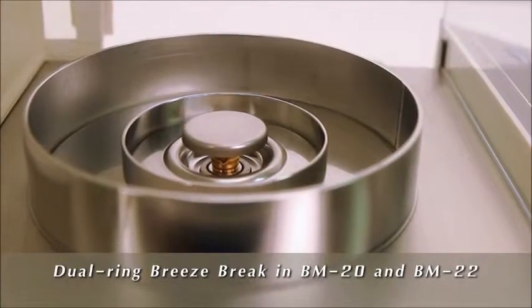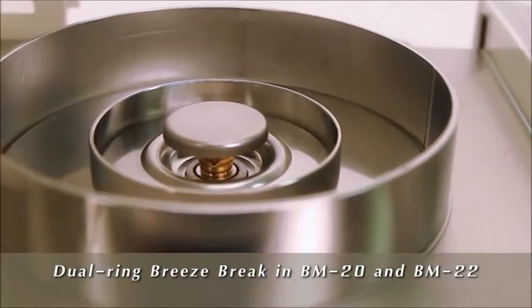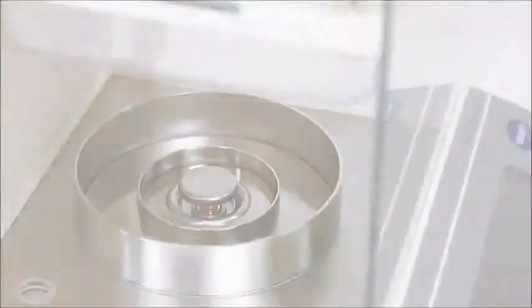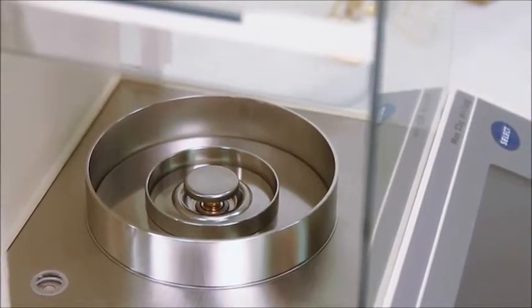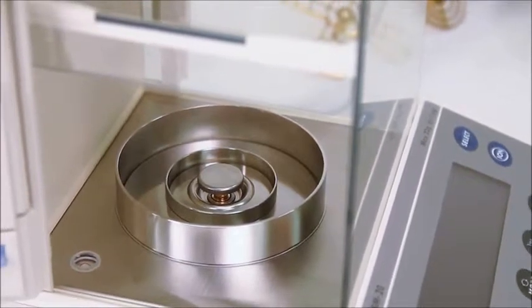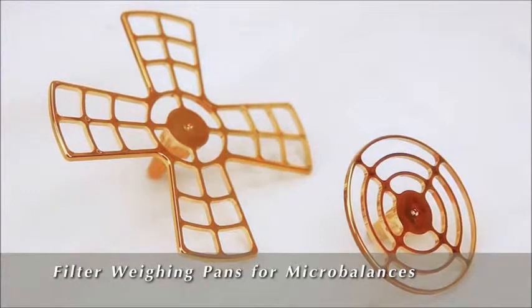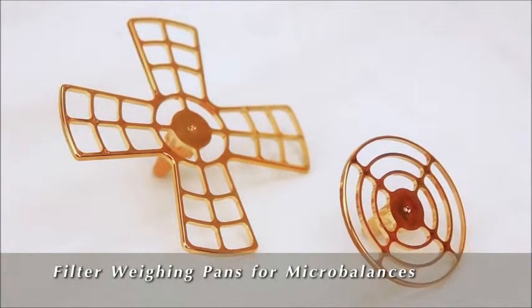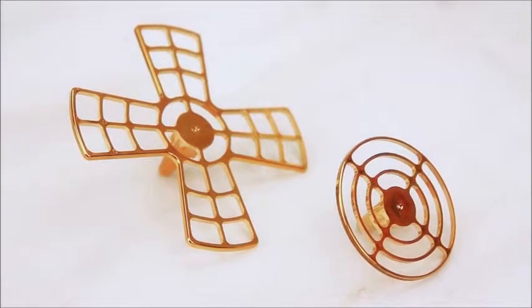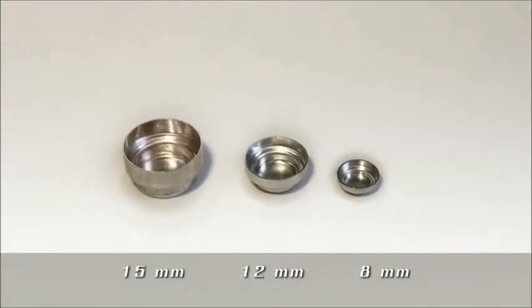The innovative dual-ring breeze break reduces drafts in the BM20 and BM22 microbalances. This feature makes a secondary inner chamber unnecessary to achieve microgram readability, giving AMD's microbalances large weighing chambers. The BM20 and BM22 also come with two extra pans specially designed for filter weighing, and a supply of disposable weighboats in three different sizes.